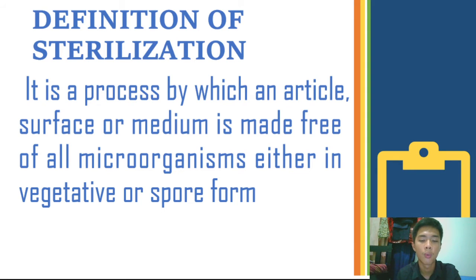Regarding what I have told you before, sterilization is very important to do. Furthermore, if the sterilization procedure may damage the instruments, then sterilization can be replaced by a disinfection procedure.